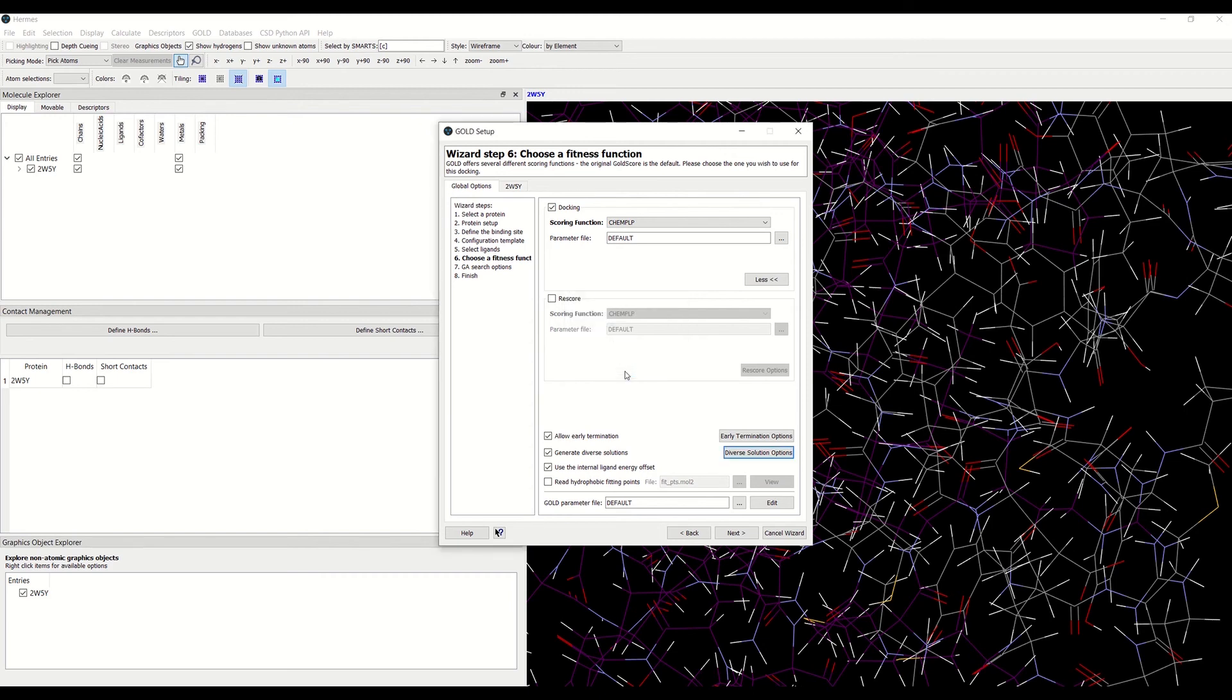It is recommended that the allow early termination option tick box is disabled when generating diverse solutions.